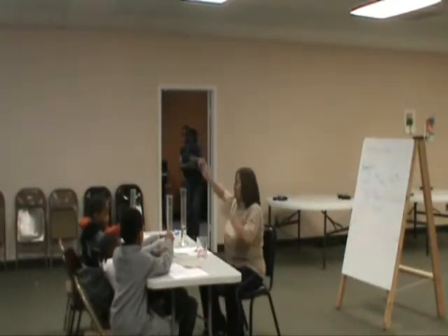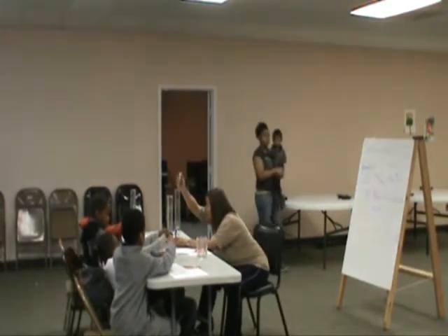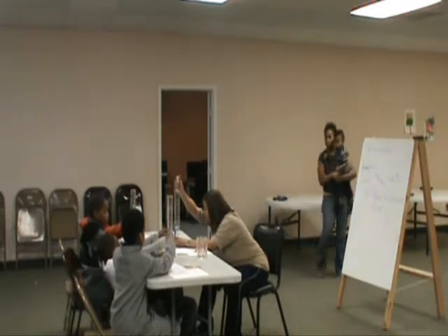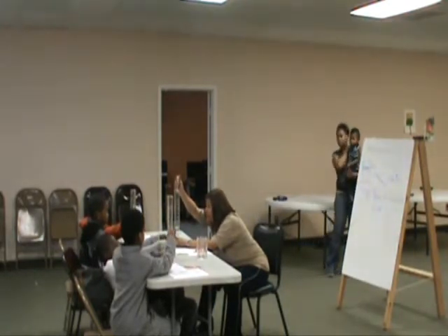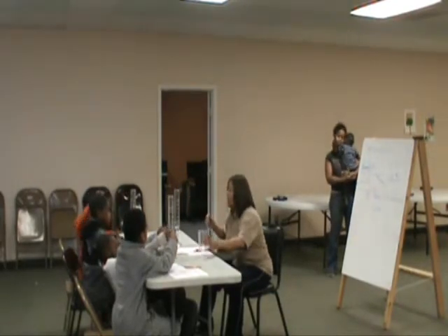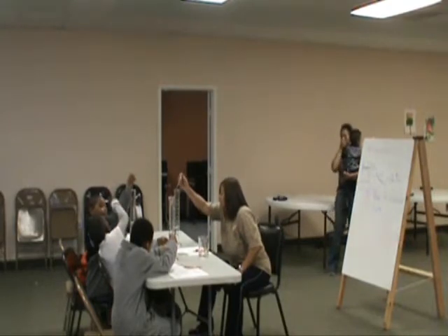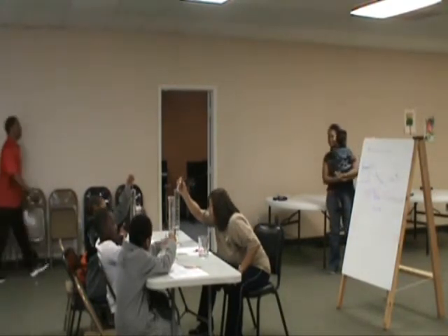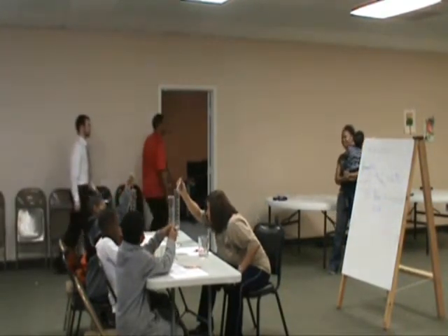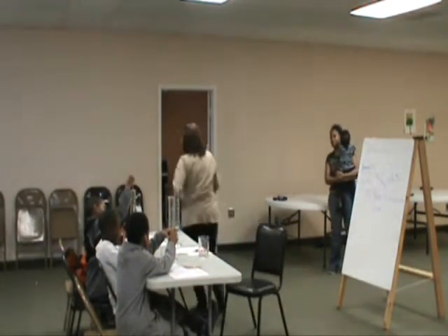Now, pipettes should be filled, and you're going to come to eye level. As you release, make sure that you're putting that meniscus right on top. We need a perfect 250. Feel it. These are skills that you guys are learning, and skills that will be with you for the rest of your life. Drop, drop, drop, drop. Okay, I'm coming around to see how you guys are doing.